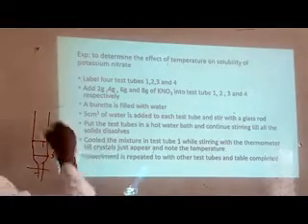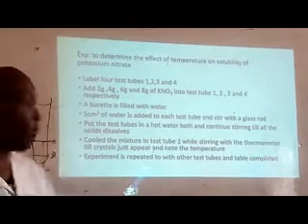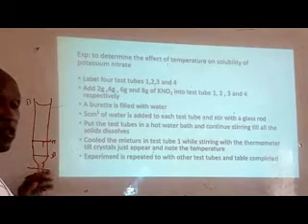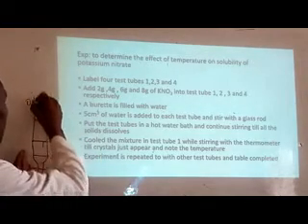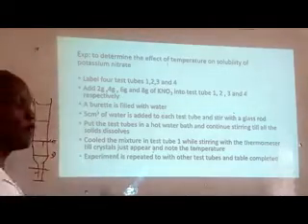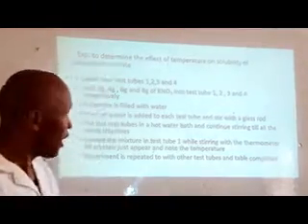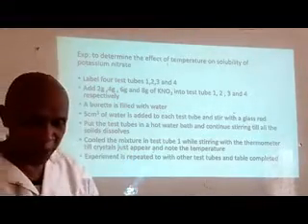So I will therefore suggest that you fill the burette up to the 0 mark, and ensure this part of the burette is also full. Then you can be running from 0 to 5, then the next experiment from 5 to 10, and it will be very easy to do that. So whatever I said, you just get the 2 grams.